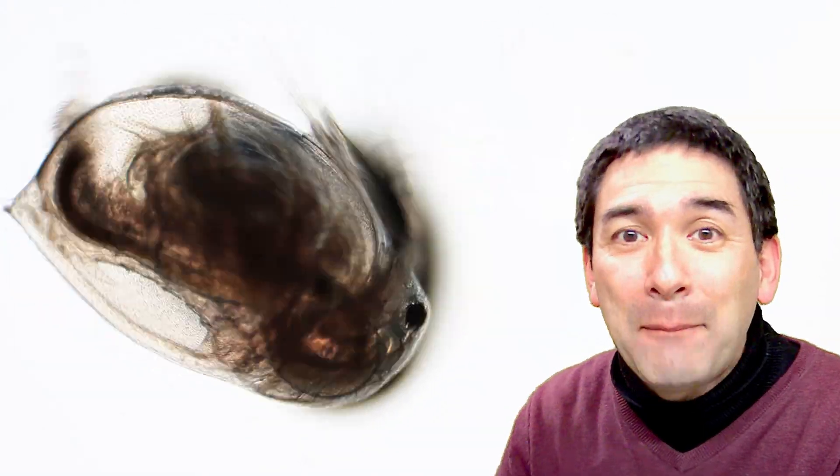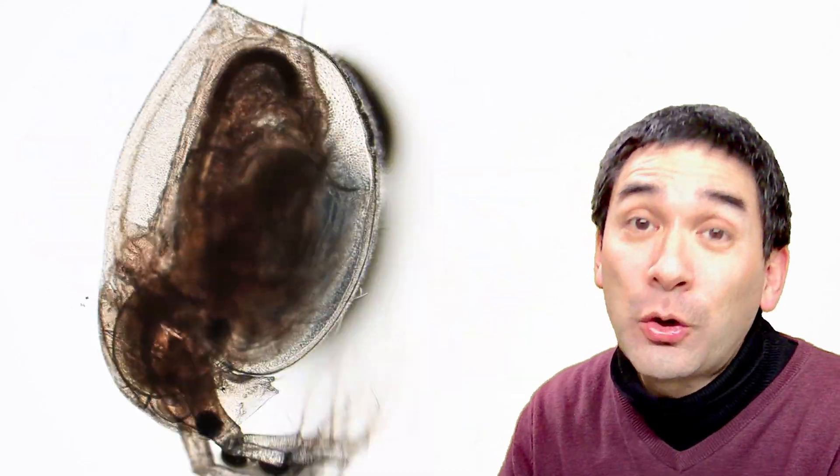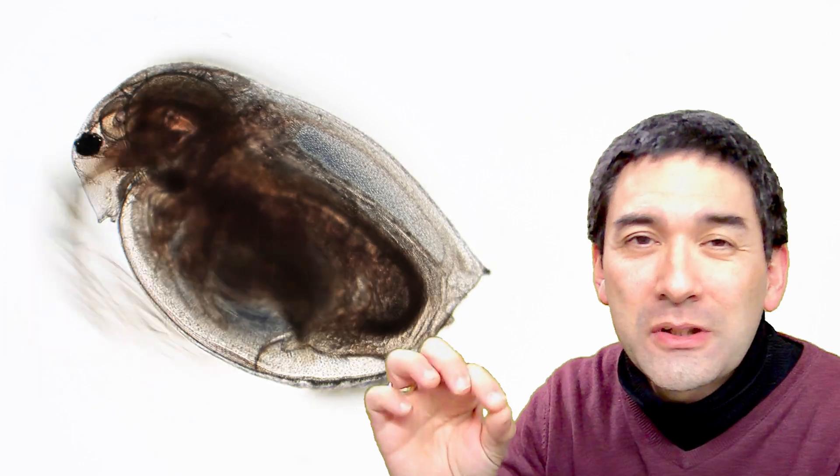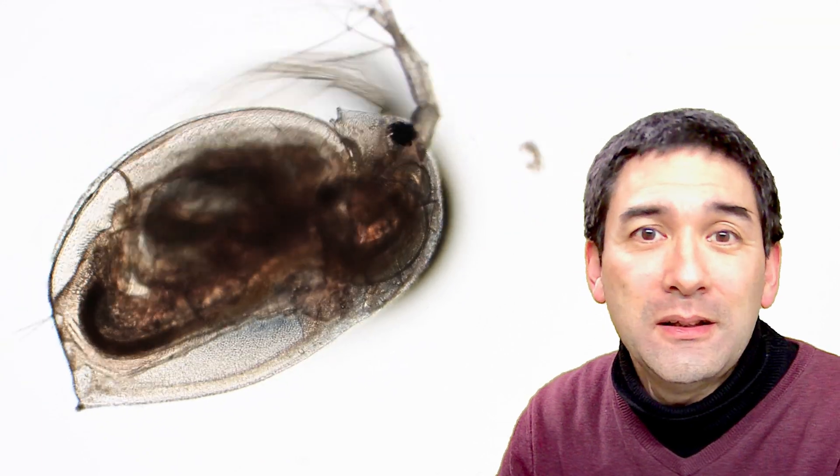Okay, the water flea is happily moving around, and they're called water fleas because of their fast rapid movement - it looks almost like they're jumping like fleas through the water. Okay, well let's start the experiment right now.